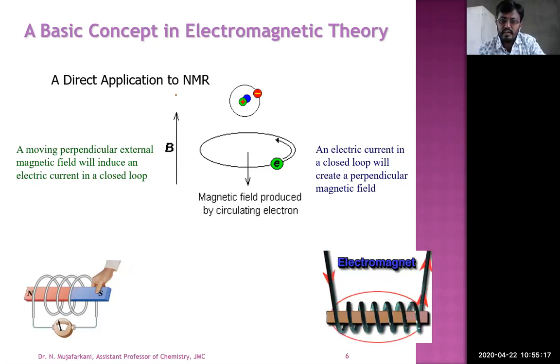Initially, it should connect with a spin quantum number. When the spin quantum number, when spin is greater than 0, only then can it be involved in NMR. When it spins, it should have magnetic energy. That is how they define it: NMR involves the interaction between electromagnetic radiation, that means the oscillating magnetic field of electromagnetic radiation, and the magnetic energy of hydrogen or some other type of nuclei.